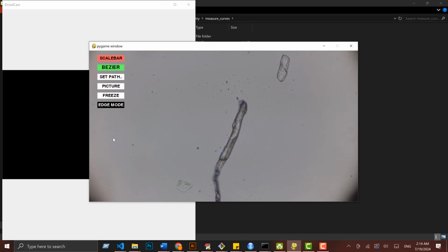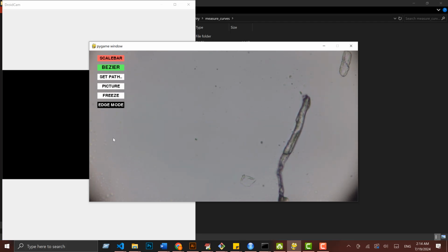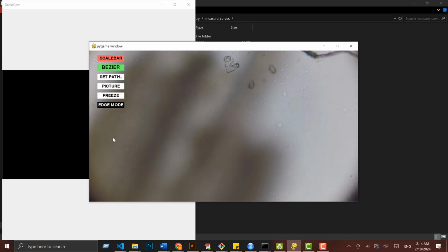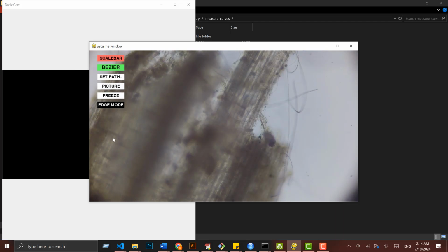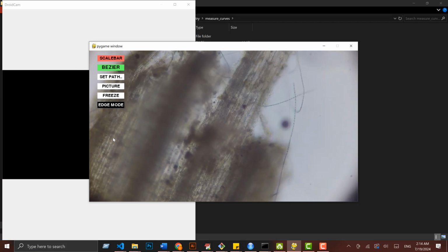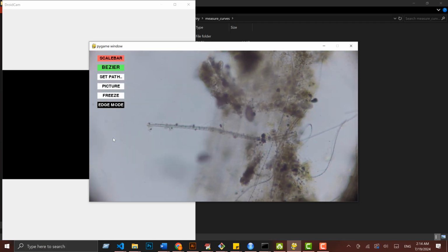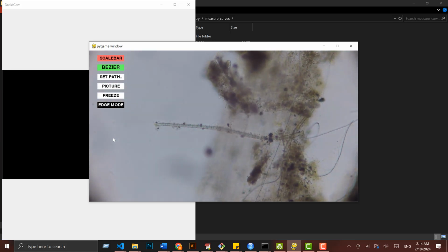That's the end of what Micrometry can do at this stage. What I would really like is, if you get the chance, for you to get in touch with me and let me know which particular needs you have. Right now, I'm about to expand it to also include a mode that allows for the gathering of data for future processing with machine learning applications. And I think that is really where the field is moving towards.